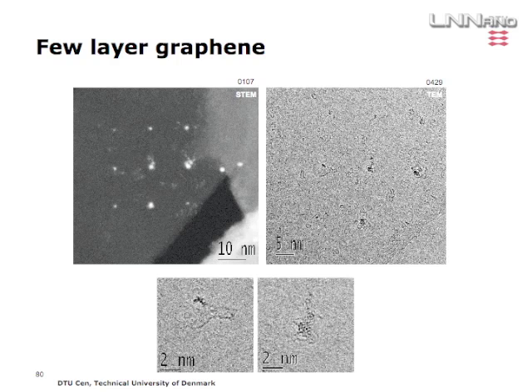And in that way, we wrote very tiny dots. You can see there's a 10 nanometer scale bar, so these dots here are about 1 nanometer big. And if you do it in TEM, it's not so easy to see, but you can easily see you have little dots of tungsten here. And I'm sure you can imagine you can write various devices on your substrate using this technique.